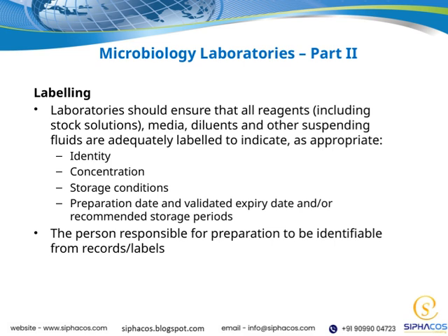Don't forget to include the preparation date and the validated expiry date, or the recommended storage period. This helps us track how long the reagent remains reliable. And finally, the label should clearly identify who prepared it, so there's accountability and a way to trace back if any issues arise. Overall, proper labeling is fundamental to maintaining quality and safety in our microbiology labs, ensuring that everything is traceable, reliable, and ready for accurate testing.